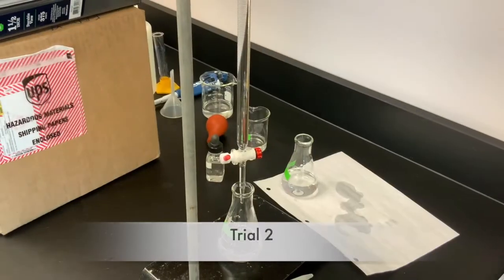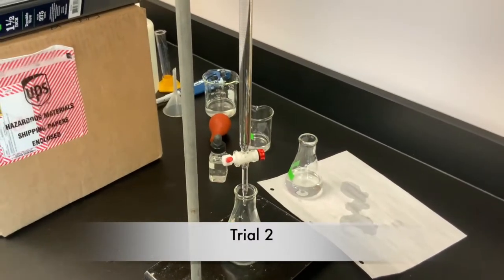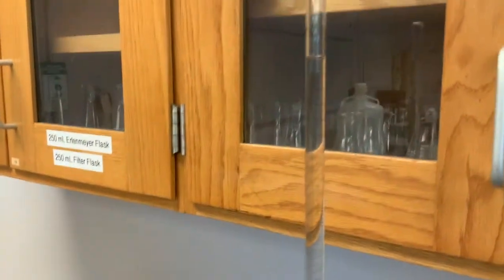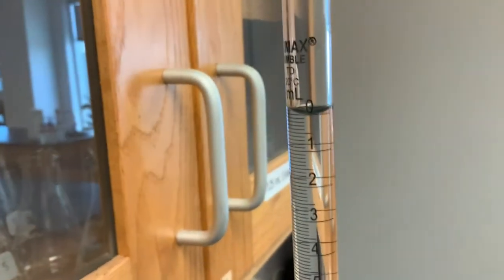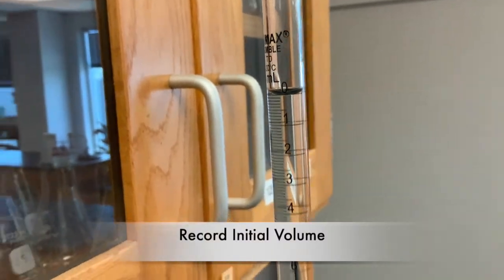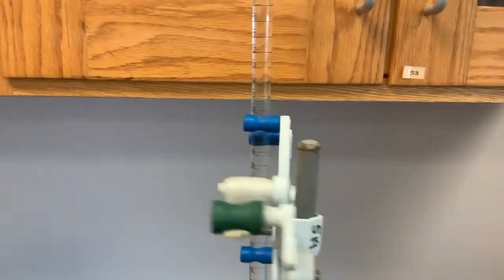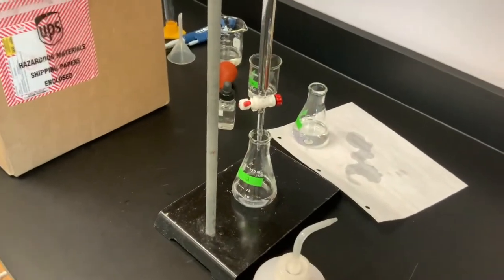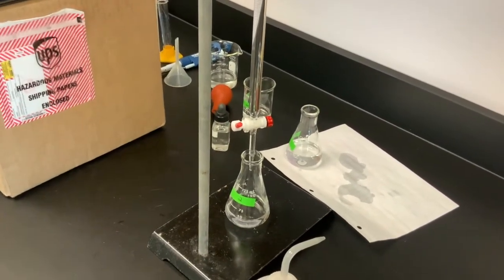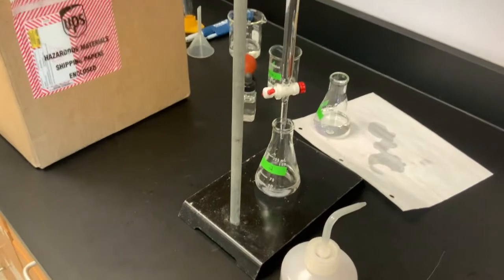two trials. So to proceed with trial two, we've gone ahead and we've taken our burette and we have filled it back up to the zero mark. So you want to go ahead and take your initial burette reading. And so what we're going to do this time, so we've got our flask that has our 10 milliliters of hydrochloric acid and our phenolphthalein in it. And we're going to add very rapidly this time our sodium hydroxide.